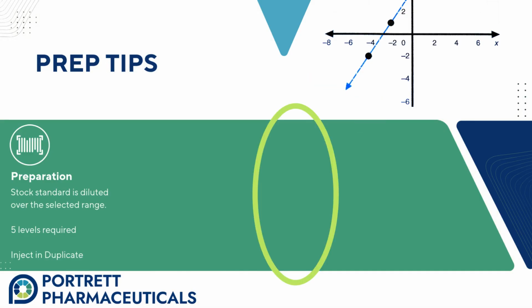Also make sure your dilution scheme does not use more than your available stock volume. The total volume in column 3 is 17 mL. We prepared a 20 mL stock, so we have enough to perform all dilutions from that same stock. It is highly recommended to inject each linearity solution in duplicate.